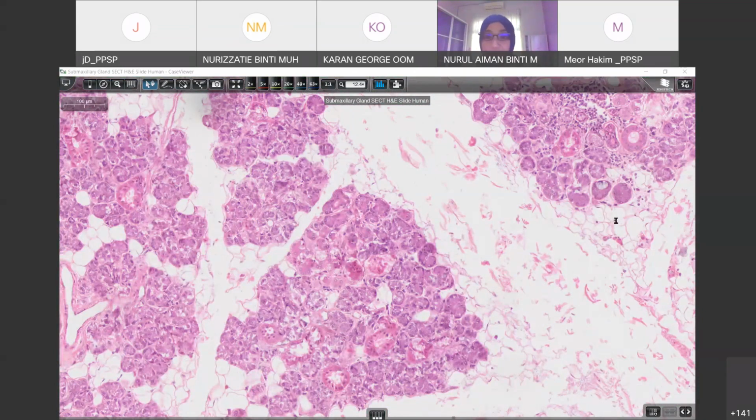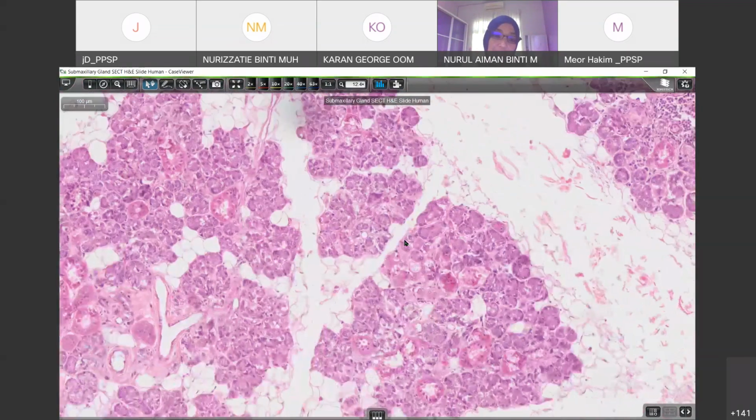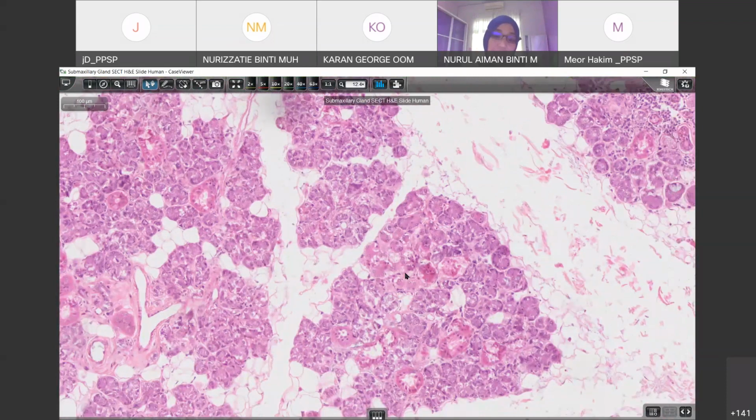Siapa bercakap ni? Who's talking now? Mio. Yeah, okay. This is Acina type of gland. Lupa nak mention. Okay, sorry.